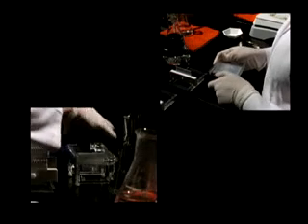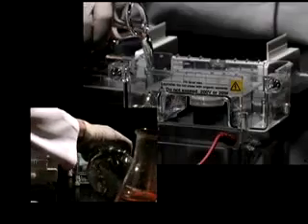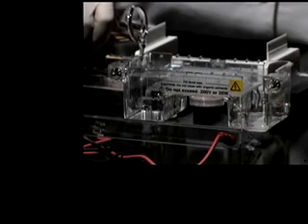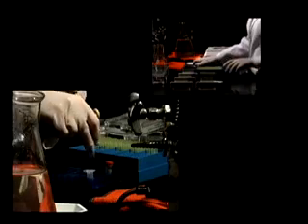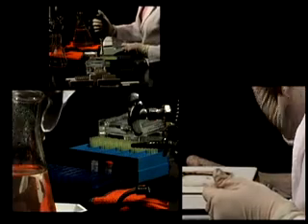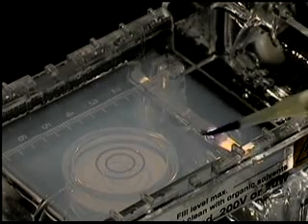Place the gel bed into the electrophoresis chamber, centered and level on the platform. Fill the chamber with diluted buffer. This type of gel is often called a submarine gel because it's submerged under a buffer. Before loading the sample, it should be heated to 65 degrees to break down unwanted aggregates. To prepare the sample for placement in the gel, mix it with 5 microliters of gel loading solution. Then load it into a sample well, taking care not to tear the gel.